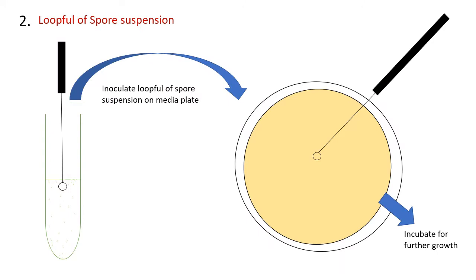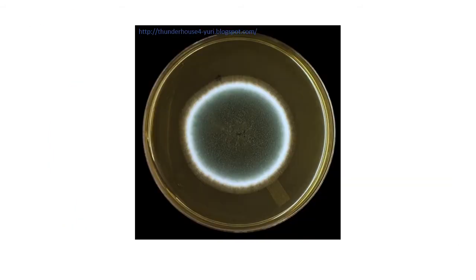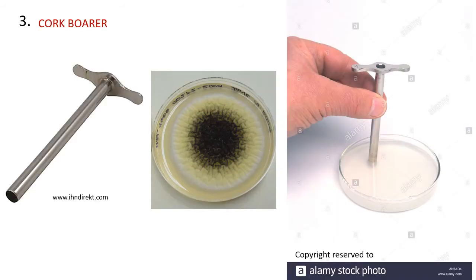Another method is using a loopful of spore suspension. Make a spore suspension and use a loopful of that to inoculate. In the case of spore suspension, you eliminate the problem of spores scattering on your media plate. You can get a beautiful plate — as shown here, this is an Aspergillus fungal plate belonging to genus Aspergillus. This is something you can add to your research paper, article, or thesis.